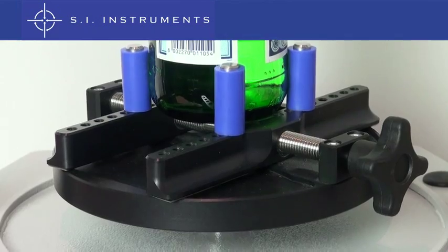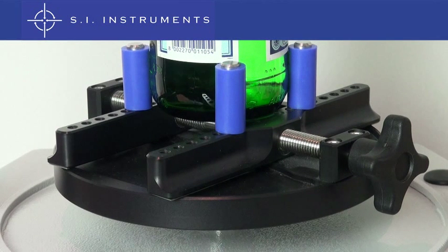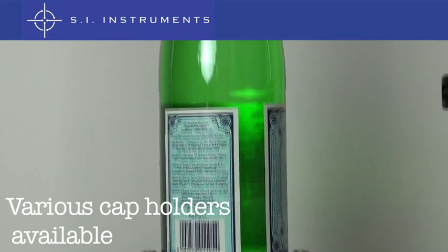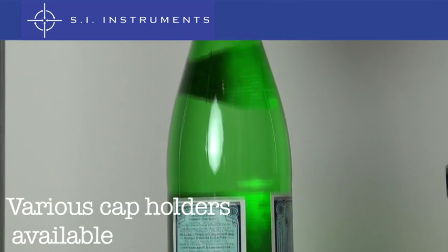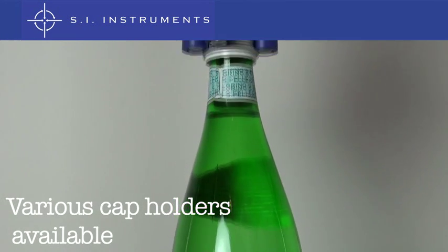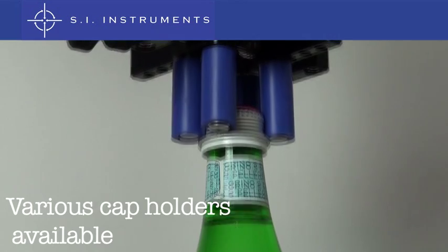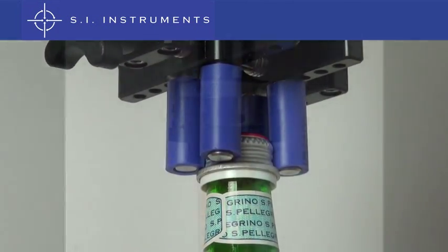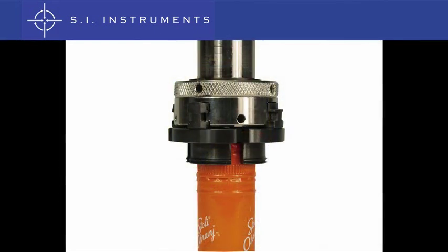On top of the motor is the bottle holder for varying sizes of bottles. On top of the bottle is the cap holder, in this case the variable cap holder for different cap sizes. Other cap holders are available.